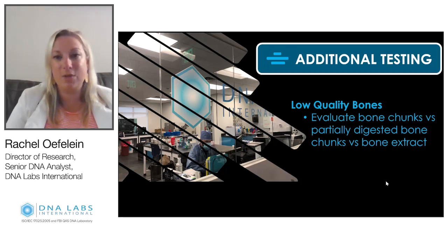All it does is save you a little bit of time off of loading on the actual CE instrument. So I would not recommend this for low quality or medium quality bones. I would stick to your original methods. Where you're really going to save time here and get good results is those high quality samples.